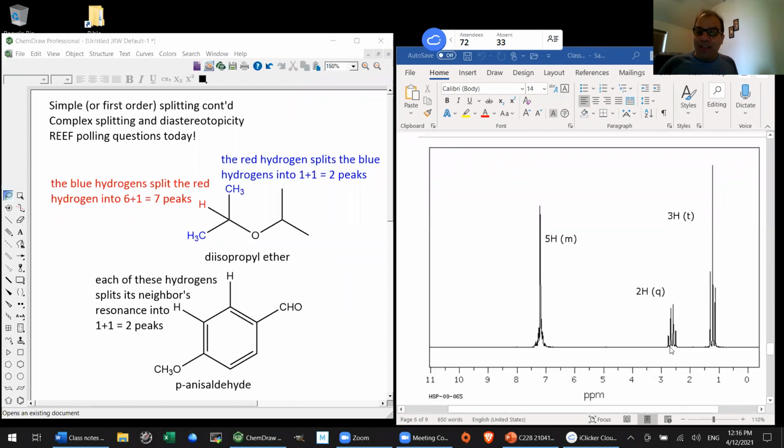And where does the CH2 come? Around 2.5, very typical for benzylic hydrogens. Benzylic and allylic and also hydrogens alpha to carbonyl, all of them tend to show up round and about 2 or 2.5. So that's exactly where I would have predicted.